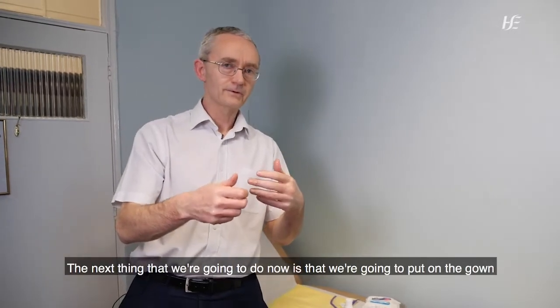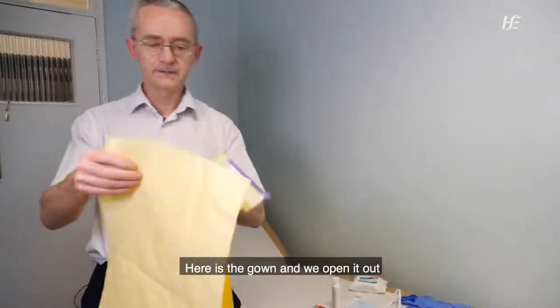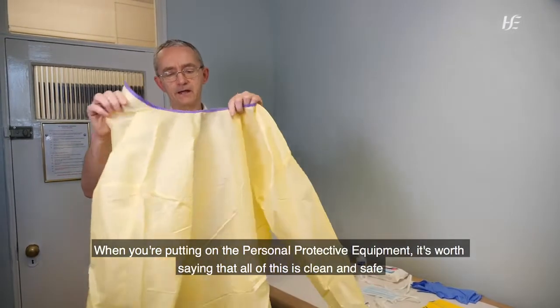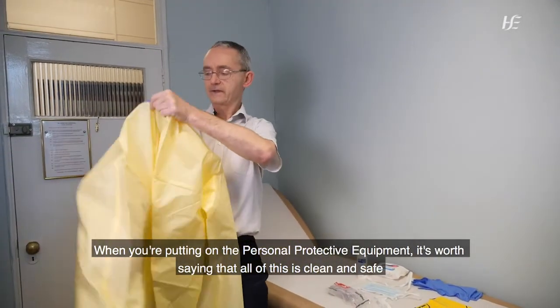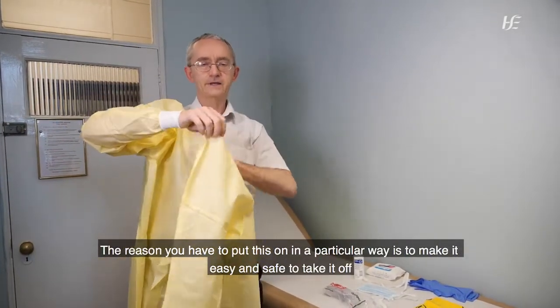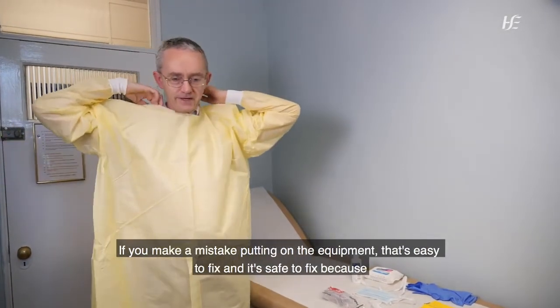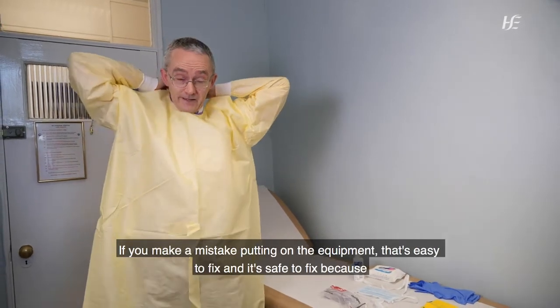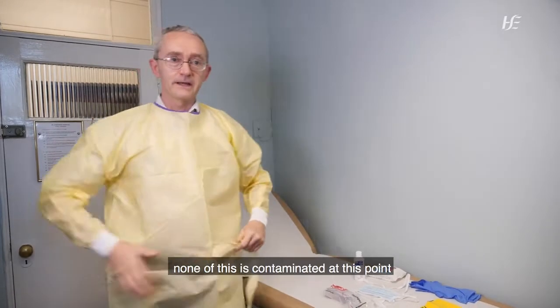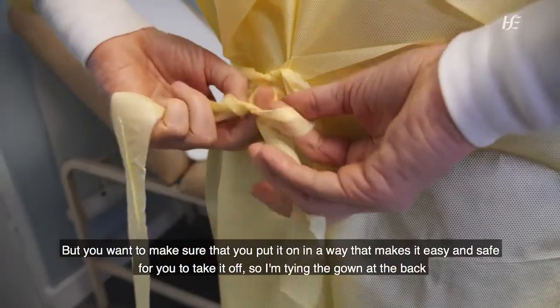Okay, the next thing that we're going to do now is put on the gown. So here's the gown. We open it out. When you're putting on the personal protective equipment, it's worth saying that all of this is clean and safe. The reason you have to put this on in a particular way is to make it easy and safe to take it off. So if you make a mistake putting on the equipment, that's easy to fix and it's safe to fix because none of this is contaminated at this point. But you want to make sure that you put it on in a way that makes it easy and safe for you to take it off.